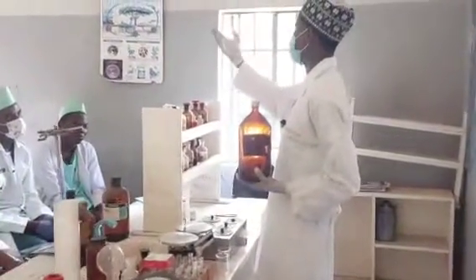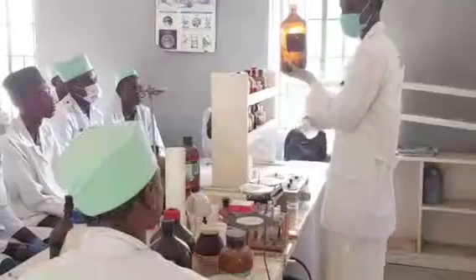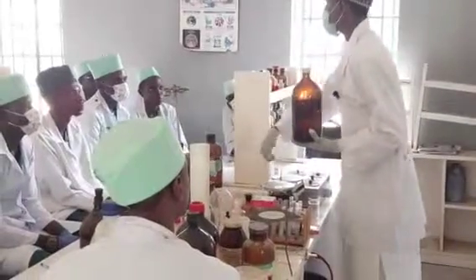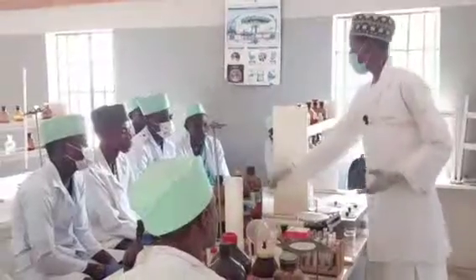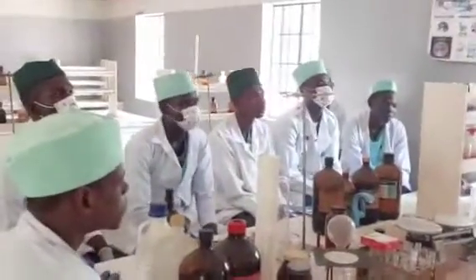So before getting what you needed, you spill it out into the sink. You should not do that. Why? Because it is concentrated. Due to the concentration, it can destroy the layer of the sink. If it is concentrated, it will destroy the layer of the sink. So this is another precaution when handling reagents.